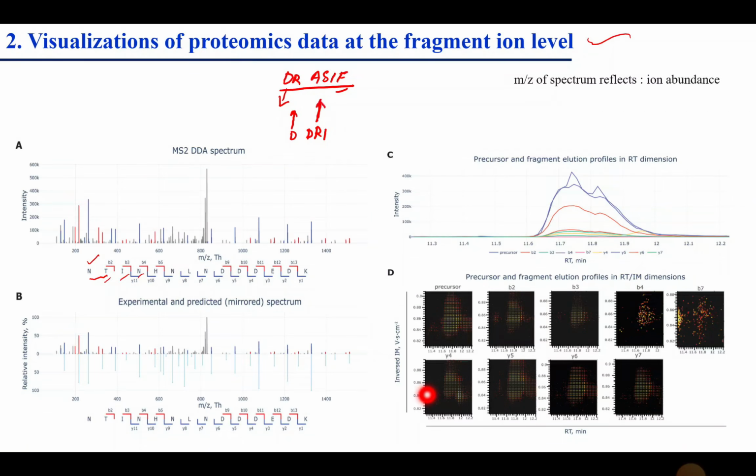Let's suppose the peak of this is here. The next one is D, R, and A. The peak is there. Now determine the difference between their mass to charge ratios. So the third one would be here. So now we can know their mass to charge ratio difference. Similarly, you can see here whenever a protein has its amino acids, we can separate them on the basis of their mass to charge ratio.